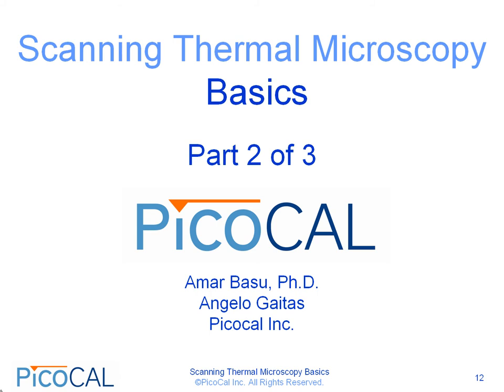Welcome to Part 2 of Scanning Thermal Microscopy Basics. In this part of the presentation, you will learn about the different types of scanning thermal probes and readout circuitry.